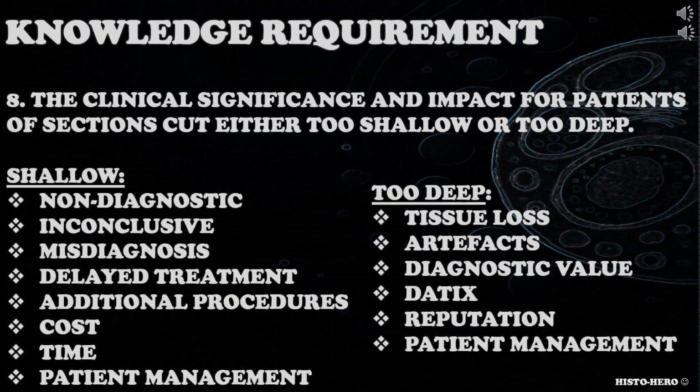The eighth knowledge requirement is the clinical significance and impact for patients of sections cut either too shallow or too deep. Candidate needs to have the knowledge and understanding about the clinical significance of sections cut too shallow or too deep. You could ask the candidate to explain, what could be a clinical significance of section cut too shallow, how could they resolve this, what could be a clinical significance of section cut too deep and how could they resolve this, what would be the impact for patients, and so on.